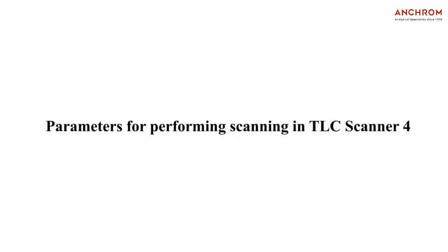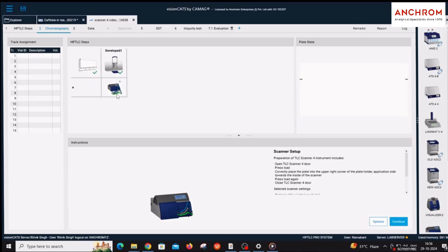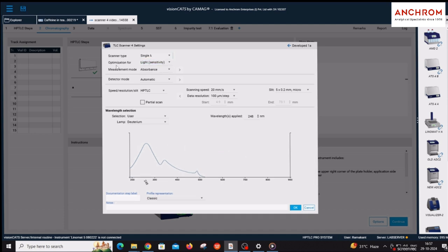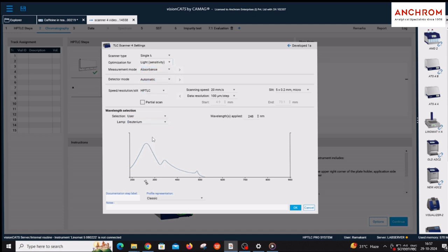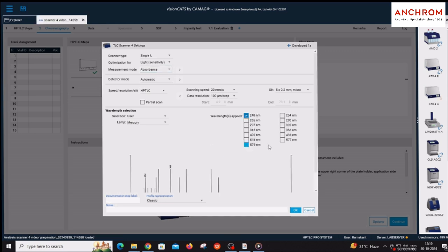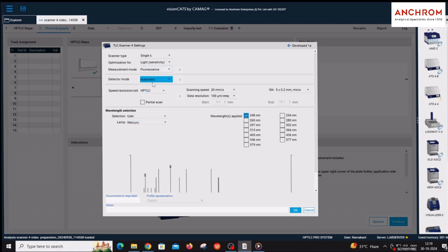For performing scanning, click on the Scanner icon and select single lambda under scanner type. Under optimization, select light sensitivity. Selection of measurement mode depends on the activity of separated compounds. For UV or visible range using deuterium or tungsten lamp, select absorbance mode. For fluorescence wavelength using mercury lamp, select fluorescence mode. The detector mode should be kept as automatic.